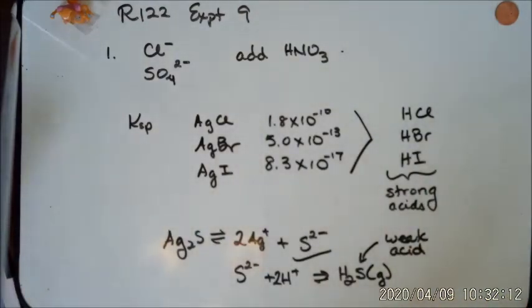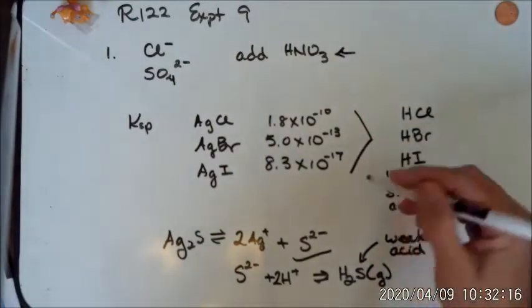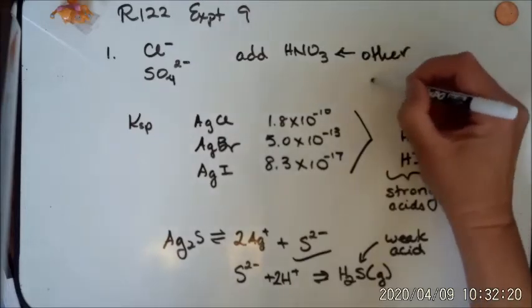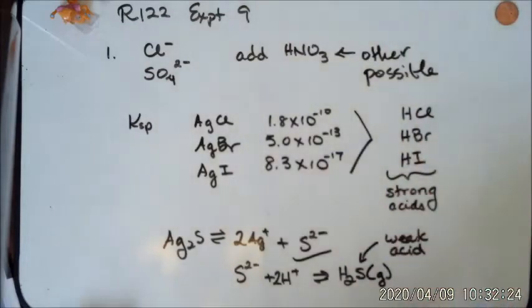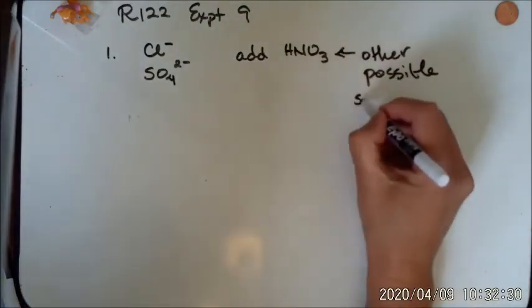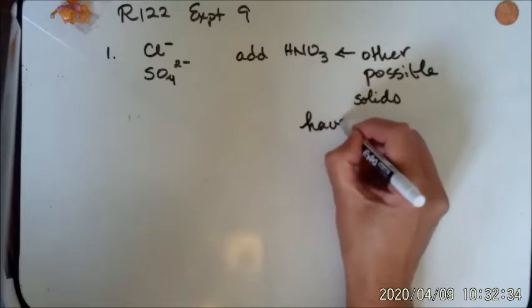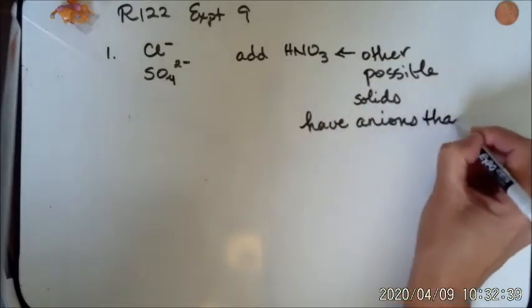So the reason we add acid is that all of the other possible solids have anions that react with H+.